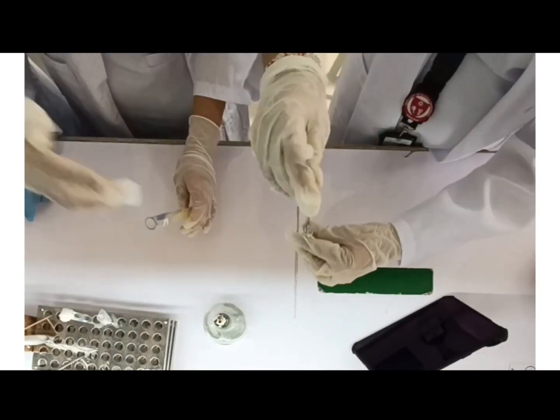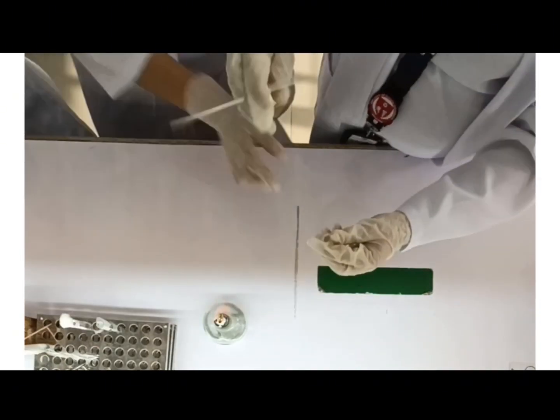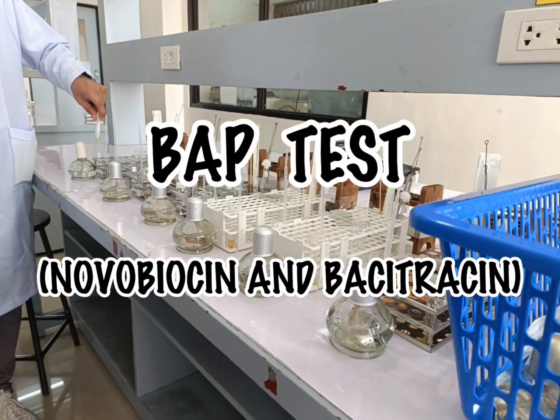To begin our MSA test and BAP test for our Staphylococcus and Streptococcus, we should first make a bacterial suspension for both Staphylococcus and Streptococcus. For our third test, we're going to have a bacitracin disc test for Streptococcus to differentiate group A from other beta-hemolytic streptococci, and a novobiocin test for Staphylococcus.